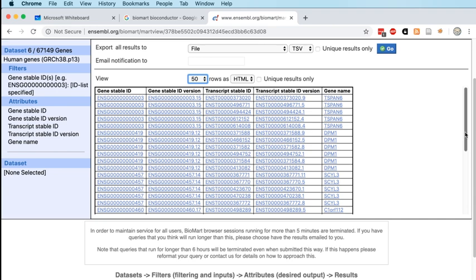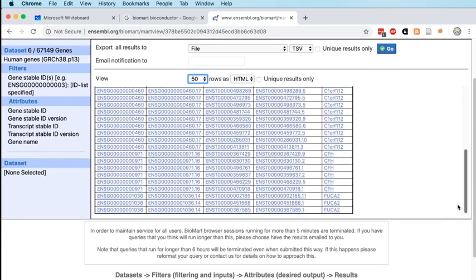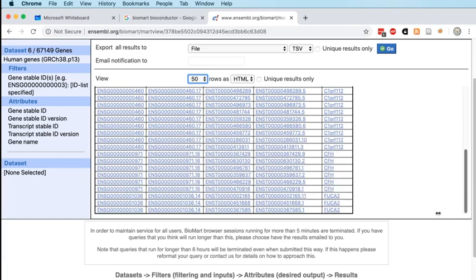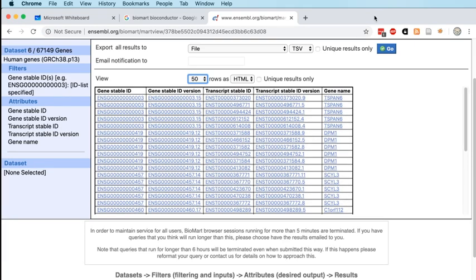There you go. 6, 12, 12 plus, no, 5, 11, 16. Lots of that. It looks similar. I can't do the count. I'm not going to do the count while we're sat here. But there isn't actually really any changes.